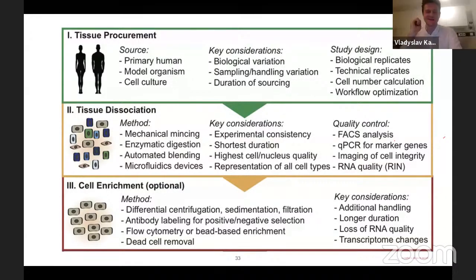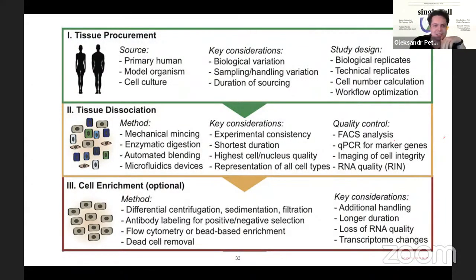I think the easiest example would be to present a blood sample or PBMC isolated samples from blood, because it's the easiest to process. So immunology then. Then we'll discuss very briefly these 6 steps in application with an immunological disease, or let's say a disease that involves immune-related cells. I think leukemia would be a nice example. And definitely with the source of the tissue, let's say human. I think it's very interesting to find the actual treatment, new molecular targets, etc.